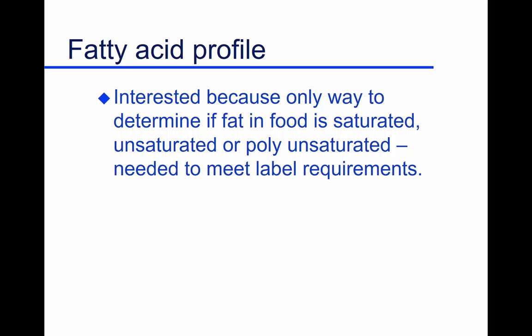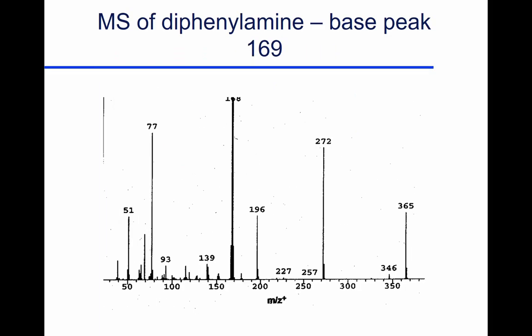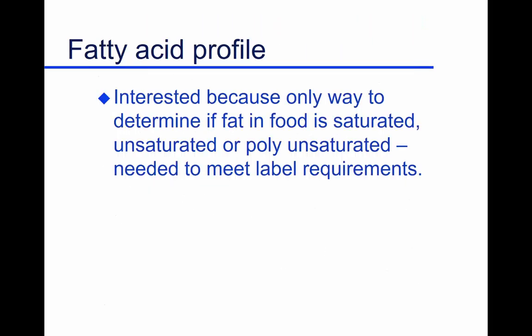What was SIM? Selected ion monitoring. So I am looking at ions. These are all positively charged bits and pieces that we're looking at here. And so we're selecting certain ions and we're measuring them as they come out of a gas chromatograph. So we're looking for that ion at 169.